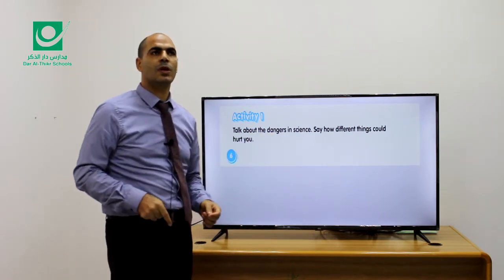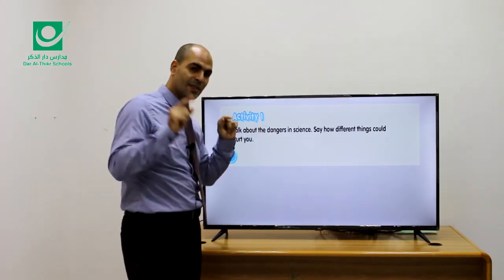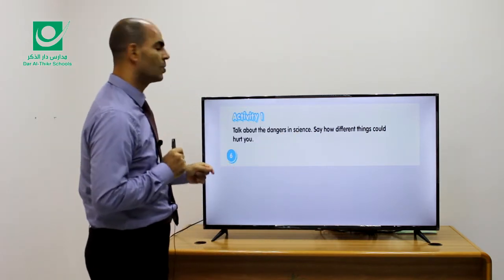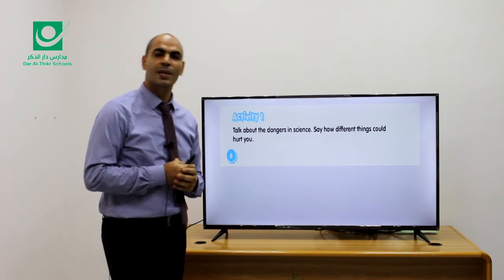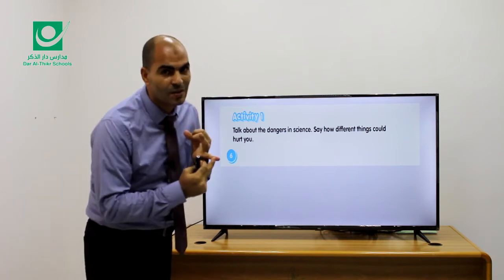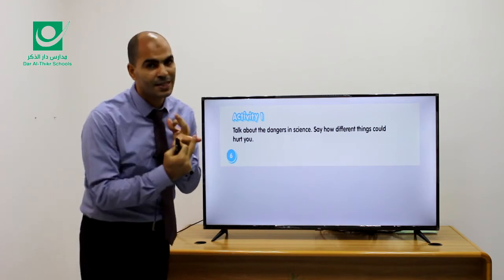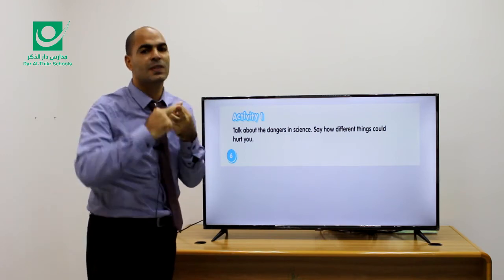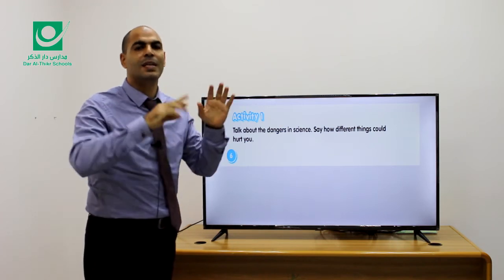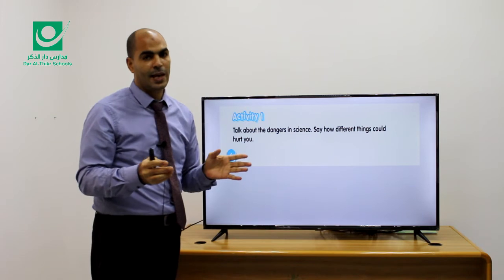We need to talk about what? The dangers in science. Say how different things could hurt you. So, in a science lab, we might find poisonous things, we might find sharp things, we might find hot things. You see? These are dangers in the lab.